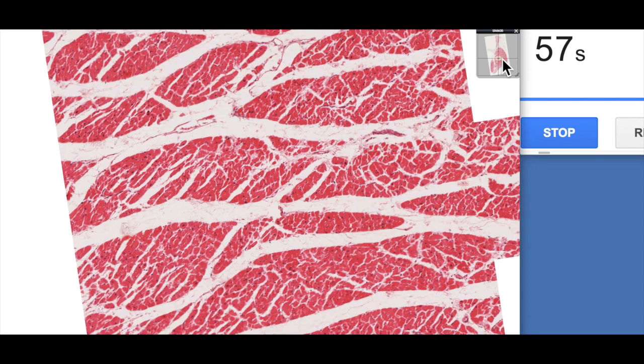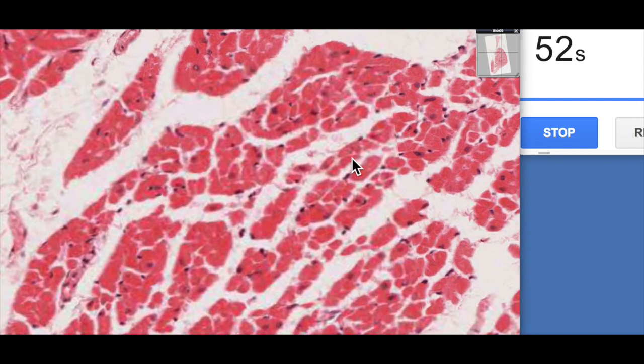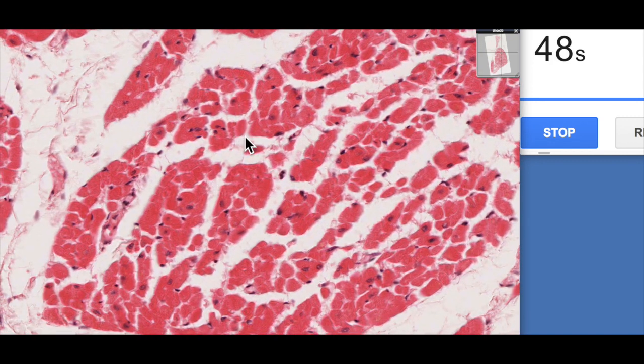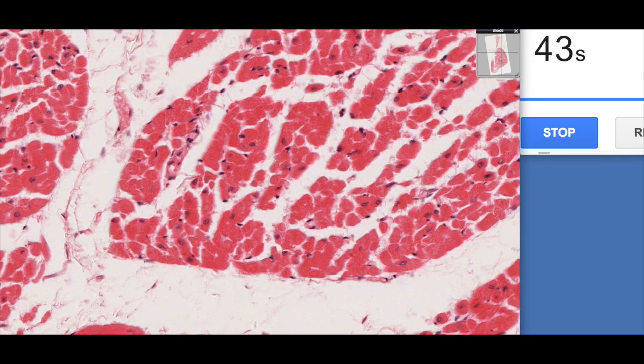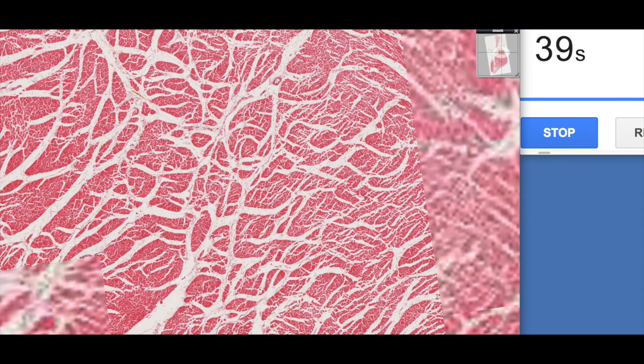And I think if we sort of zoom out to the periphery here, we can actually see some of these in cross section a little bit better. So you can see that they're a bit larger cells. Obviously they've got to contract further, create greater pressures to be able to move the blood through the body. Whereas the atrium only needs to move the blood down to the ventricles.